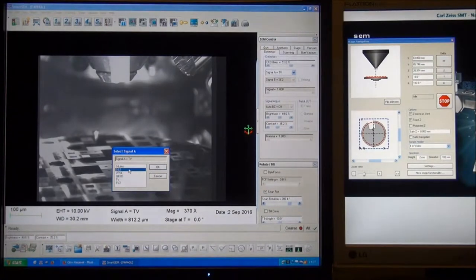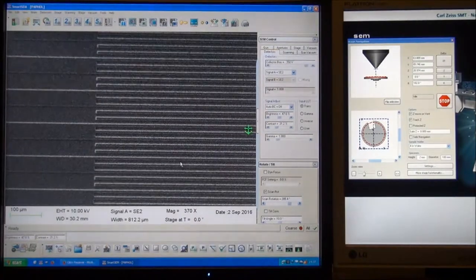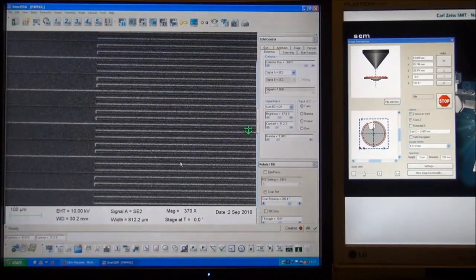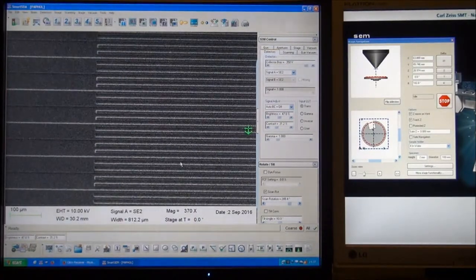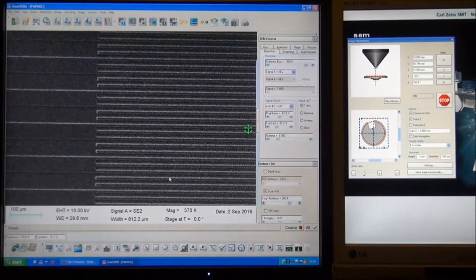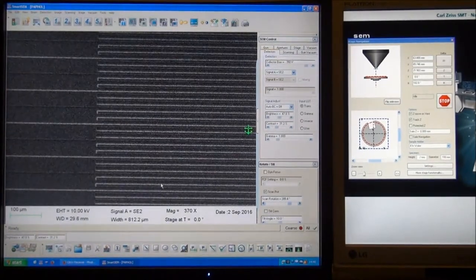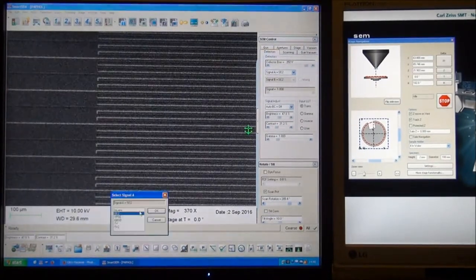We are choosing the SE2 detector, so we can go to the detectors and see the signal from that one. Let's change back to the TV signal.